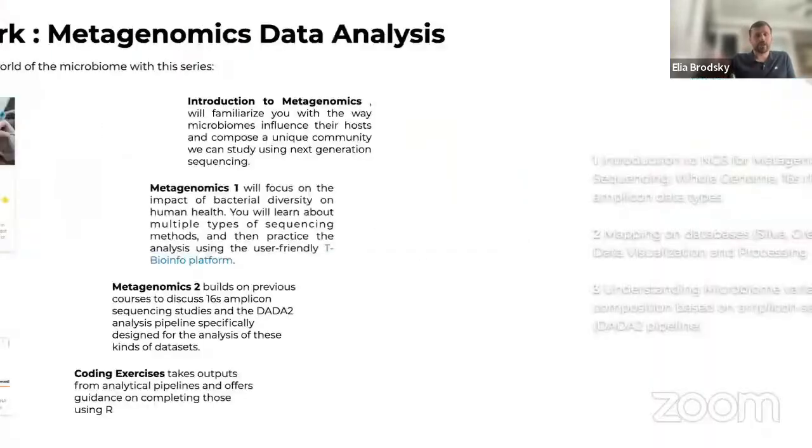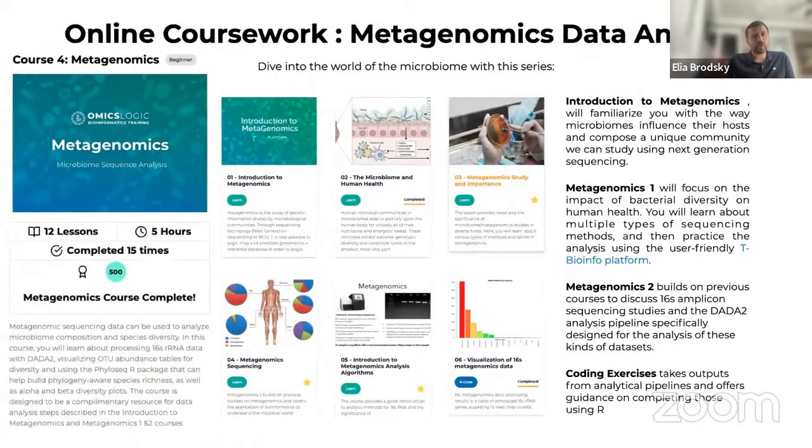And that's why it's important to get familiar already with the portal, how it works, and how the different content present on that portal can be leveraged. There you will find some basic coursework, as well as practical exercises in R and Python. We'll primarily talk about R because it's extensively used in metagenomic data analysis, and also because it provides us with very nice looking figures that we can directly use in research publications.